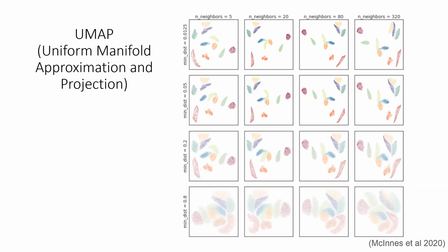I read most single-cell RNA-seq analysis papers with a very high level of skepticism in what they say. There are useful ways to evaluate clusters, but the best approach is always to have some orthogonally labeled data so you can at least compare your clusters to some historical notion of what cell identity is, and maybe find some unexpected differences in what the field says about cells expressing X gene versus the observed heterogeneity within them.